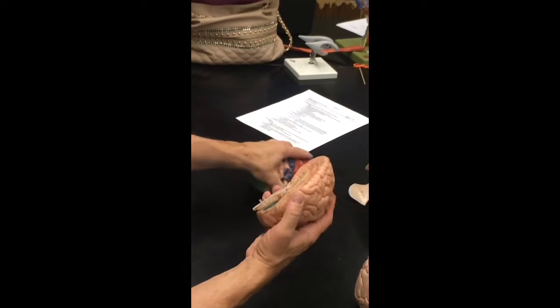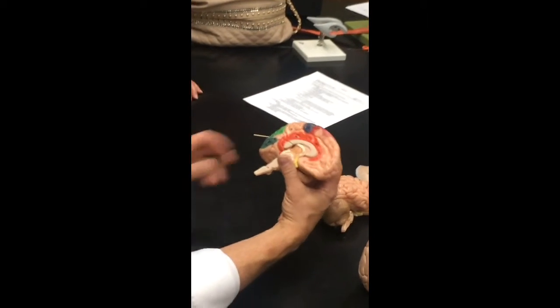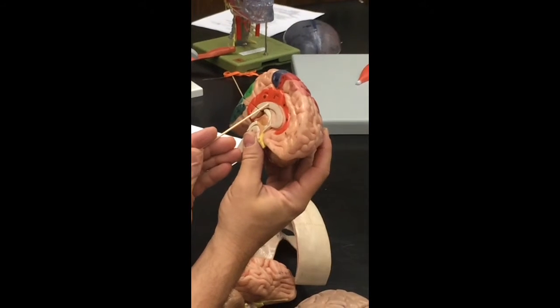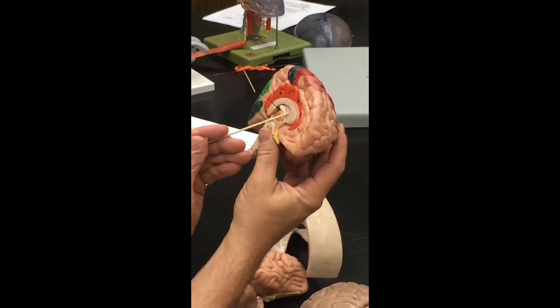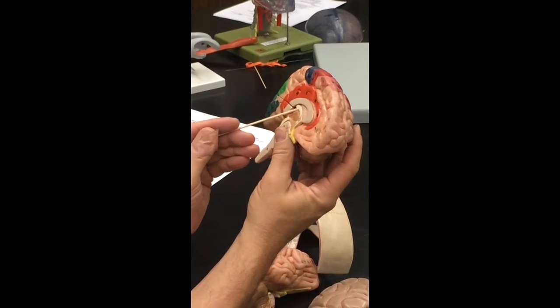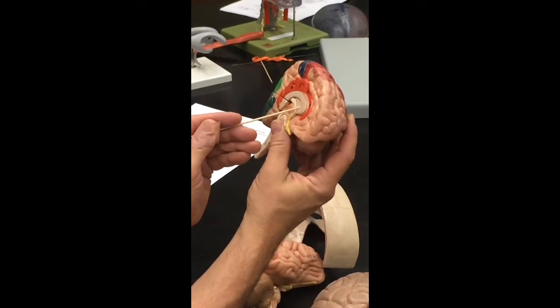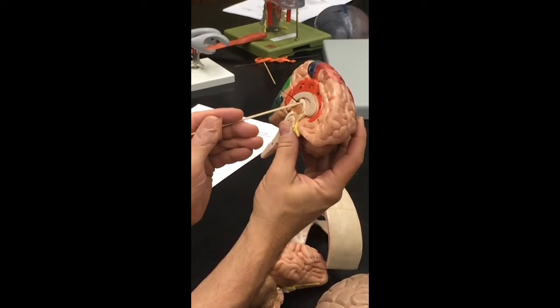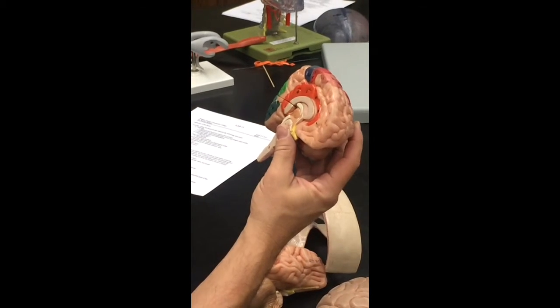The next couple structures I want you to find, you're going to open up the brain like this. Oh, lost the cerebellum. Look at that. This structure here is the corpus callosum. Right under it here, septum pellucidum. Here is the fornix. So this forms the roof of the lateral ventricle. This is in between the lateral ventricles. This is the floor of the lateral ventricles. So that's it for the cerebrum.